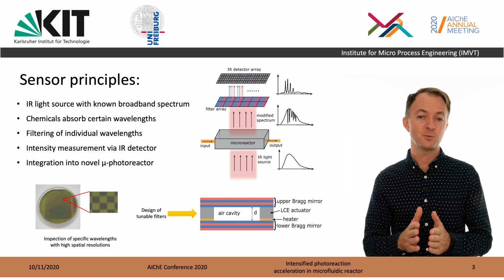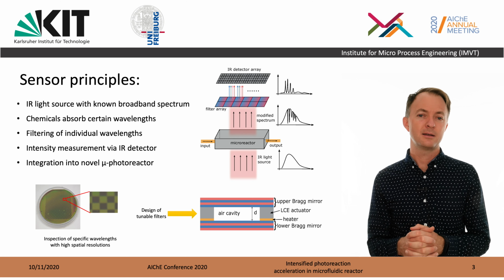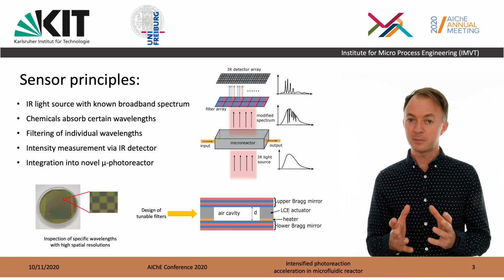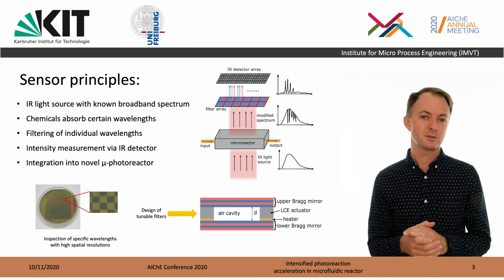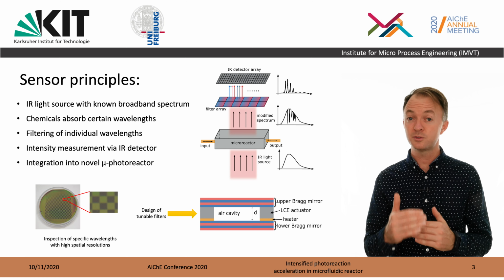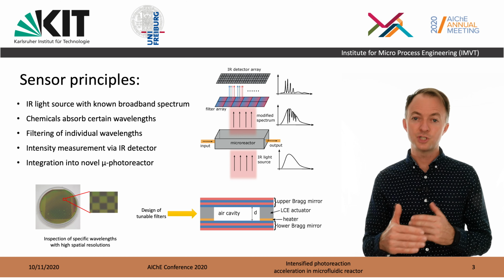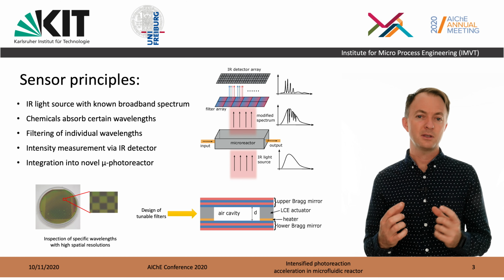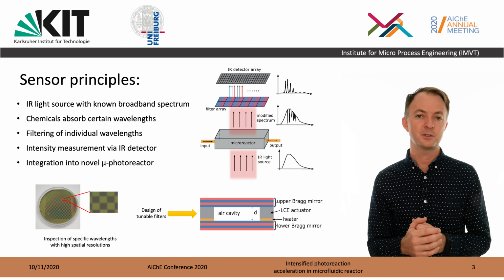This is the concept that we are pursuing in this project, in particular through our colleagues at the Uni Freiburg. An additional degree of flexibility that they are building into these sensors is the concept of tunable filters. These are filters that rely on a particular concept, and we can talk about this more in the chat session, to achieve the filtering. And by having a variable spacing in those filters, it's possible to have a variable filter.